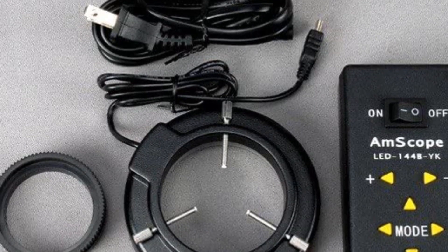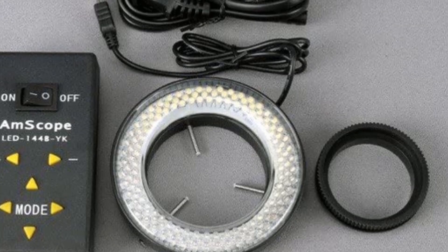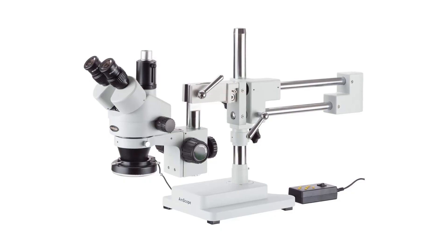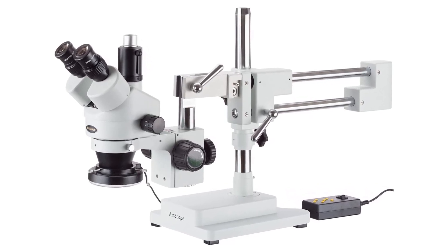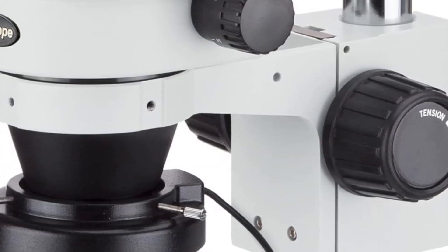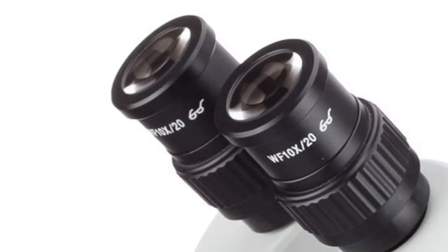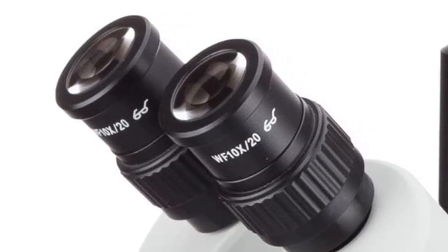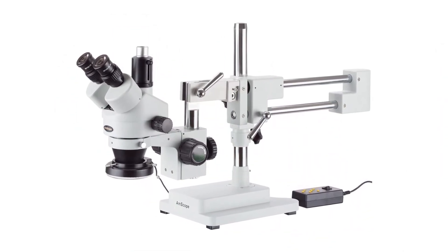Pros: high level of magnification from 3.5x to 90x, zoom objective from 0.7x to 4.5x, includes a 4-zone LED ring light for better illumination, double-arm boom stand for more stability, includes 0.5x and 2.0x Barlow lenses for increased magnification, and works with 110V to 240V power supply. Cons: expensive compared to other microscopes, and can be difficult to set up and use for inexperienced users.